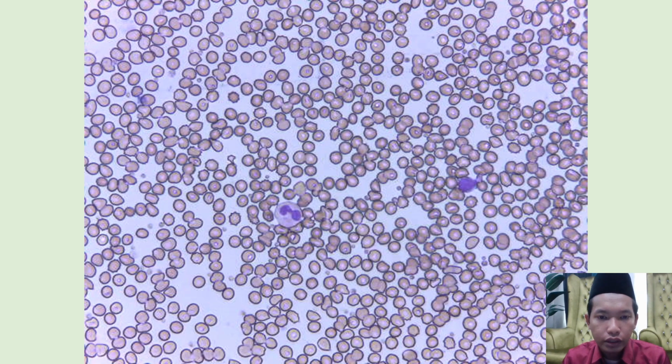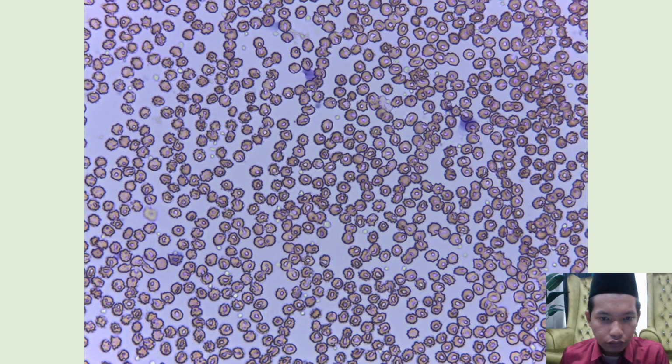So this is the third diagram of the result, 10 minutes UV in 3 days. What we can see here, some normal cells, but there are some burst cells and teardrop. Stomatocyte unclearly. So this is the result of the third diagram.